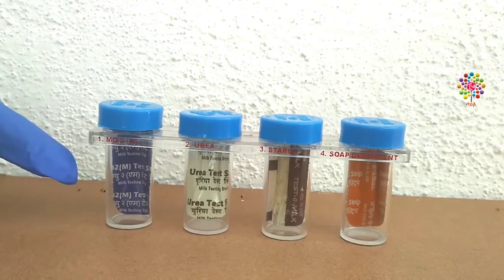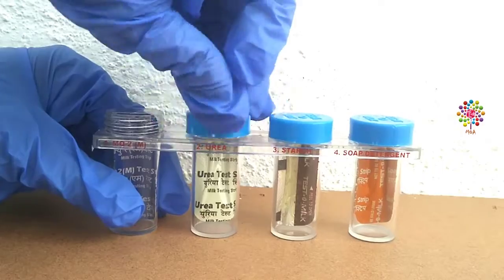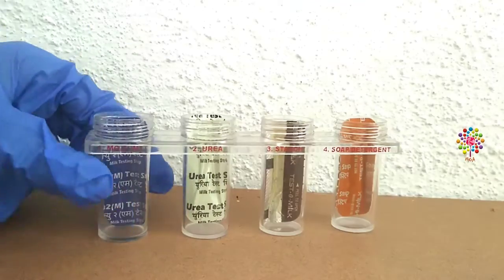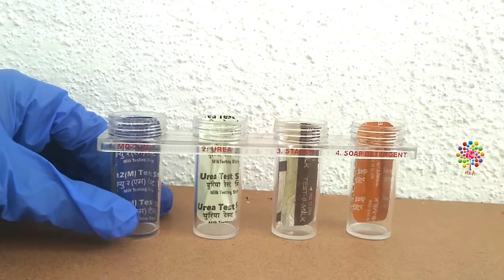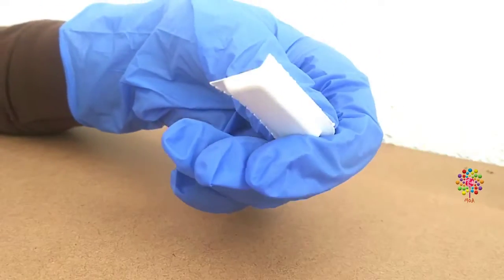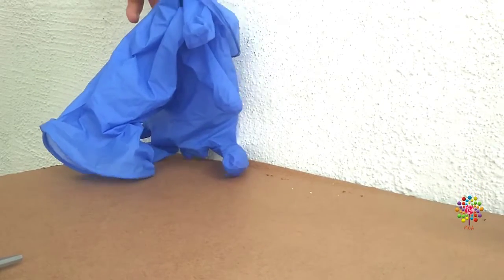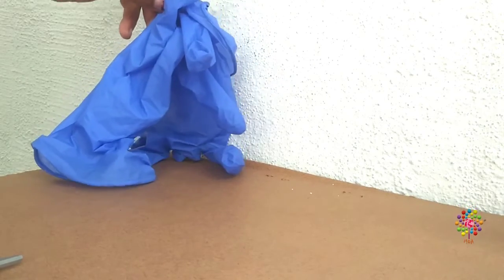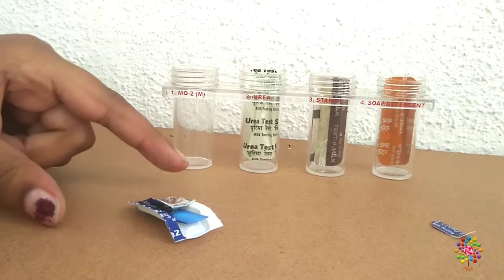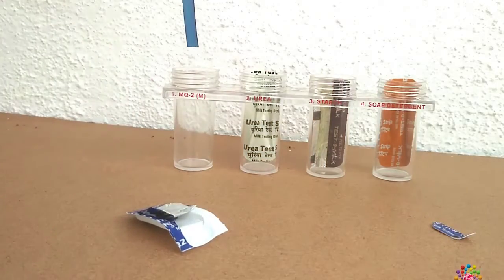Let's start with the first one. Let's open all of them. Let's open all the test strips. I have cut it. Guys, we actually don't need gloves. I thought these things are not safe for us, but as I have forceps, I am safe. Here I have opened it. There is a small blue color wrapper inside. I will take it out and let's keep it inside here.